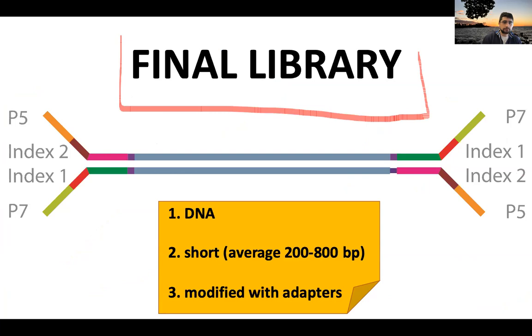So do we have DNA? Yes, we already had DNA to begin with, so that was always checked out. Is it short? Yes, we performed fragmentation. Is it modified with adapters? Yes, we just ligated our adapters onto it.